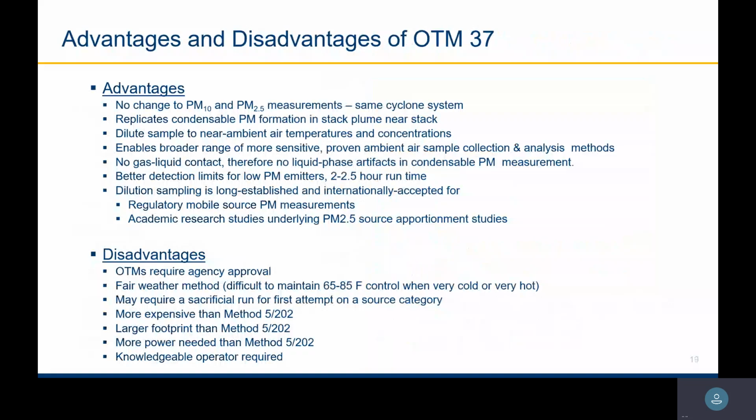The other thing is on a really, really cold day, we had to heat it up. Heating things is easier though. We have a lot of heating blankets, and we can easily heat that chamber and maintain it at 80 degrees without much trouble. But it is another concern.